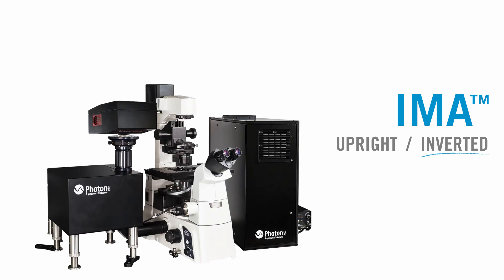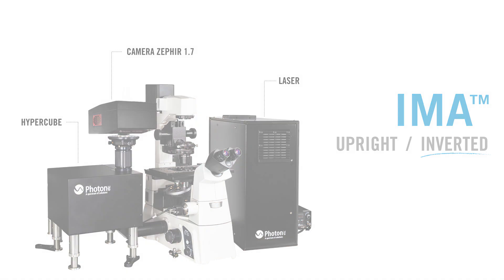AIMA can also be configured with an inverted microscope. In this case, the hypercube is mounted on the side of the microscope. Note that the laser and beam shaping module can be installed on either side of the system. This setup is shown using Zephyr 1.7, an InGaAs camera designed and manufactured by Photon ETC.